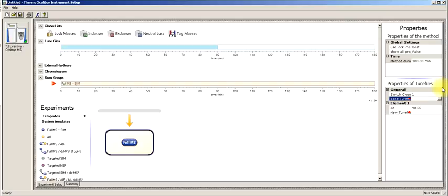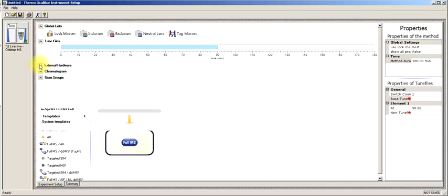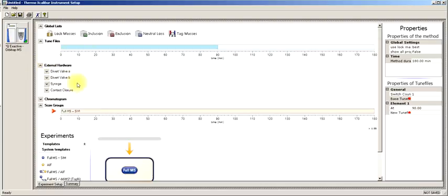In most proteomics applications, this isn't something we're really interested in, but it's a capability that's here. There were some papers a while back where they were using triple quad instruments to do positive and negative on phosphos, and that's something that may come back, and this would be a way to do that, where you could have positive and negative tune files, or multiple runs. But that feature is here.